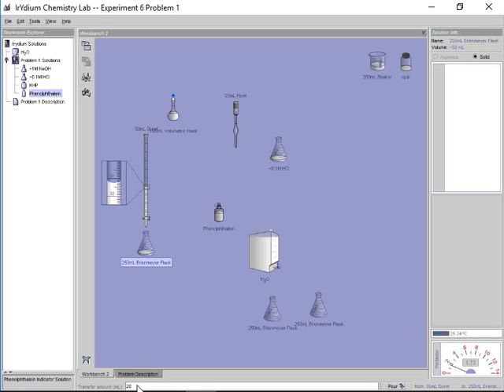So maybe I'll drop it in. Again, this is just trial and error here. Toss it in maybe 1 mil at a time as I get close to that 25 mil mark. Then drop it in a little bit smaller quantities, maybe 0.5 at a time. And then as I believe the pink color is staying for longer, maybe drop it in 0.05. I want to be as precise as I can. Let's see if I don't overshoot it this time. You want to be really meticulous as that color change appears within a matter of a drop. So the other one was 40.02, so it should be getting really close here.